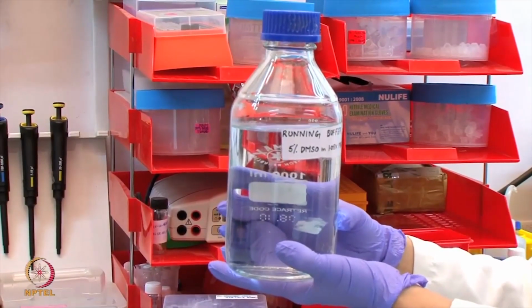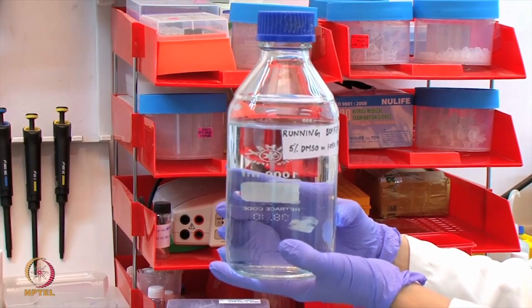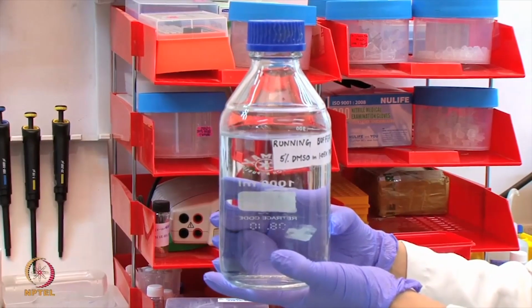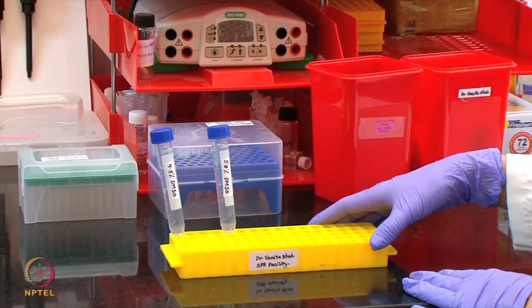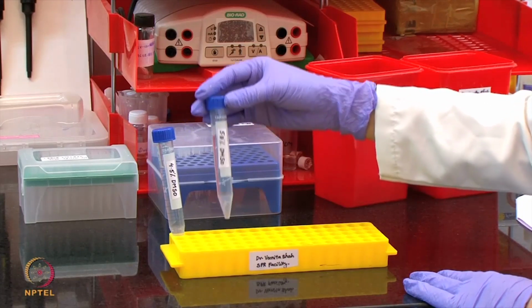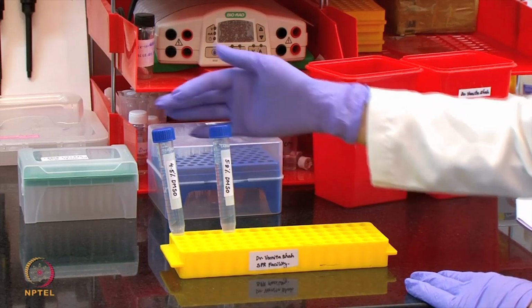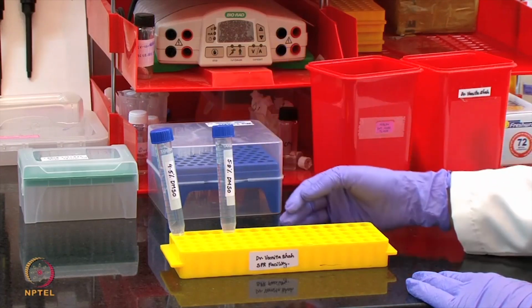In this protein small molecule study, we will be using 5% DMSO in 1.05x PBS as the running buffer, which will also be used for the initial startup cycles. 8 different solvent correction solutions will be prepared ranging from 4.5% DMSO in PBS to 5.8% DMSO in PBS, and these solutions will be prepared by mixing in different ratios as shown here.